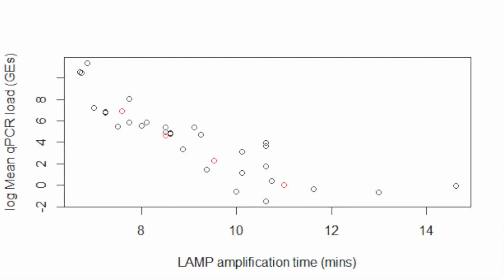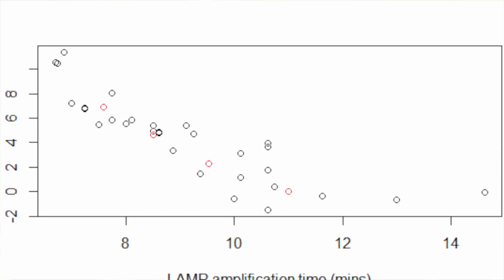We've been trialling loop-mediated amplification, or LAMP, as an alternative to quantitative PCR. The benefits of LAMP are twofold. Firstly, it requires a single, constant temperature, unlike quantitative PCR, which requires several stages of temperatures throughout, and therefore requires much more complex equipment. Secondly, the results are generated much faster. With LAMP testing, we've found positive samples from the field within 6 minutes of running the assay. With the PCR, even when you've got it to the lab, you're talking 2.5 hours before you get your result.